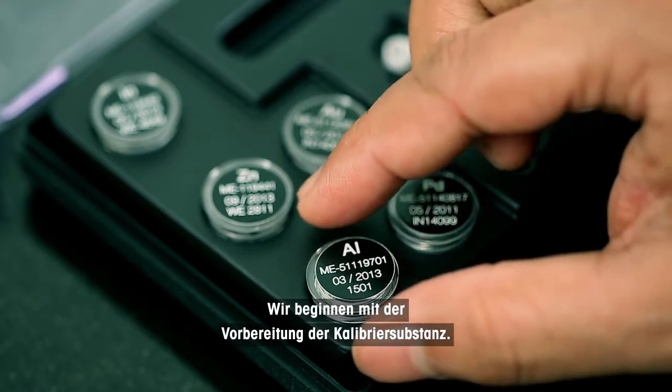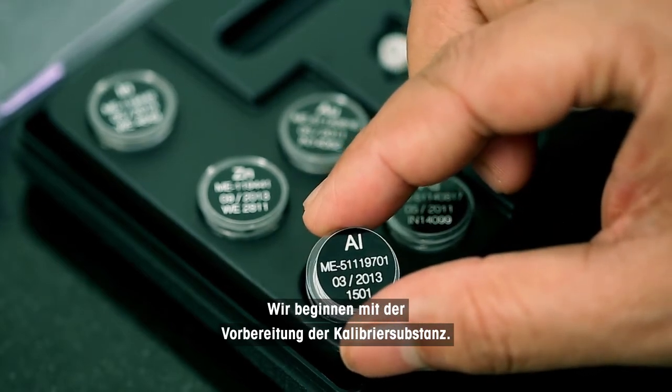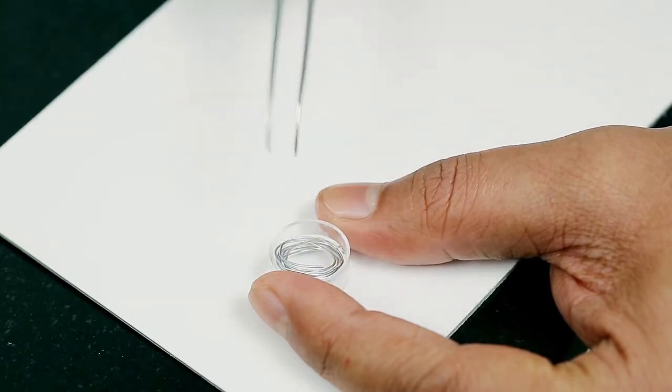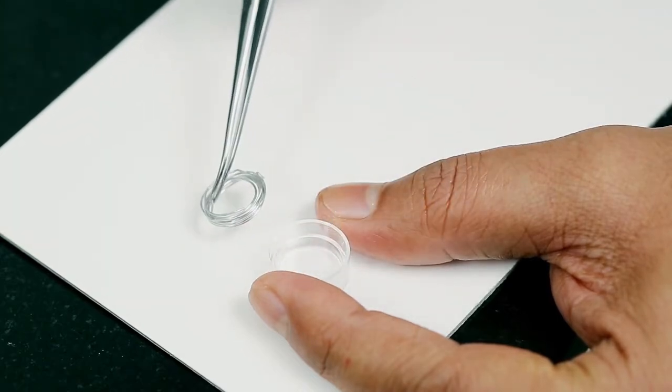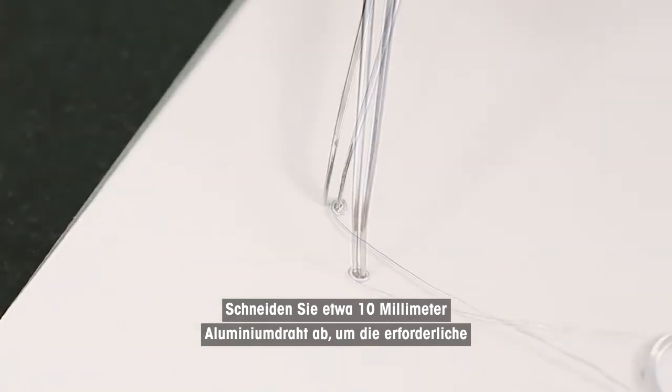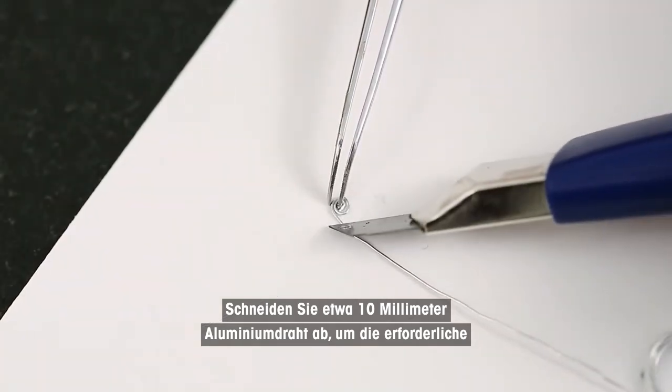Let's start with the preparation of the calibration substance. Cut approximately 10 millimeters of aluminum wire in order to achieve the necessary mass and wrap it around the tips of tweezers.